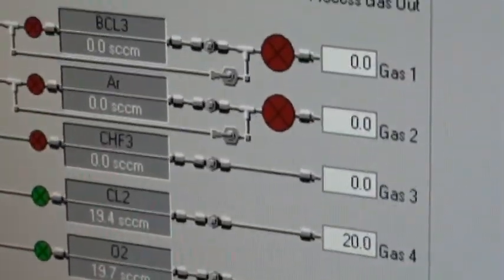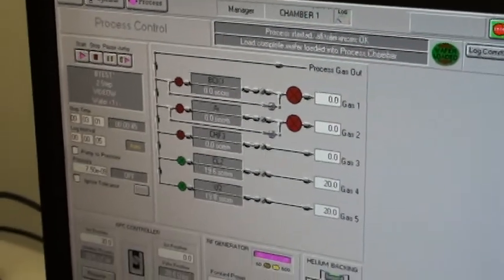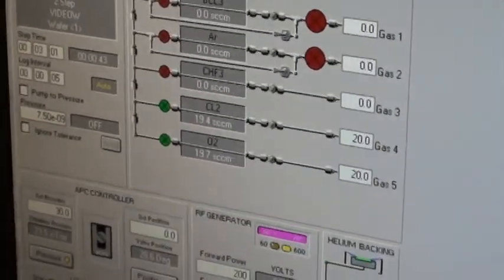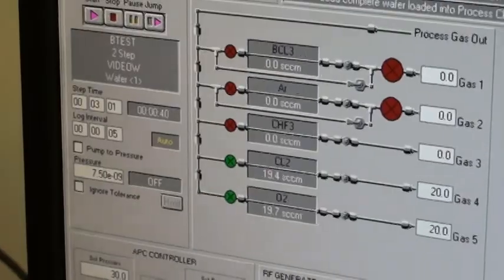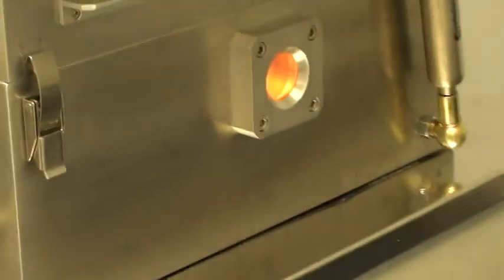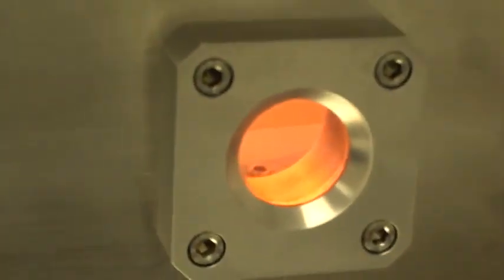48 seconds left. Now it will finish running this plasma. We'll shut everything off. It will pump the chamber back down to base pressure. And it will automatically unload the wafer. So your plasma has about 30 seconds left.